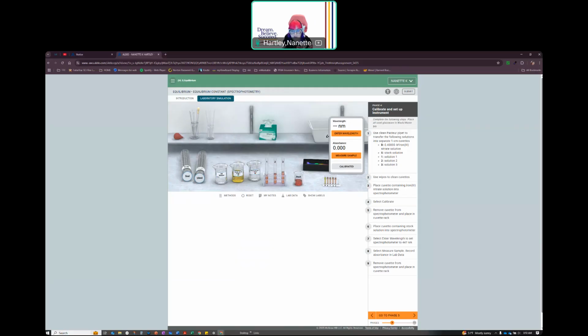So now I'm going to put the stock in there. 447 is the wavelength that we're looking at.